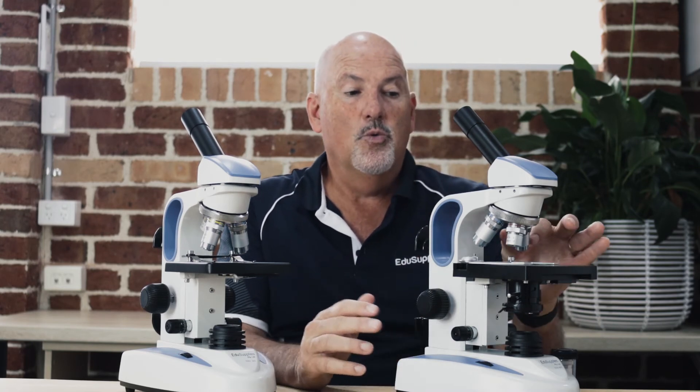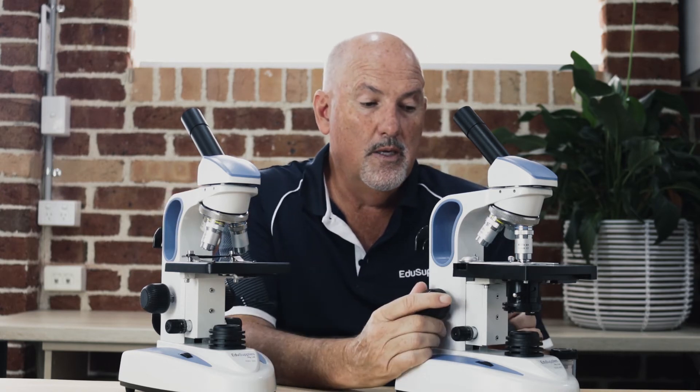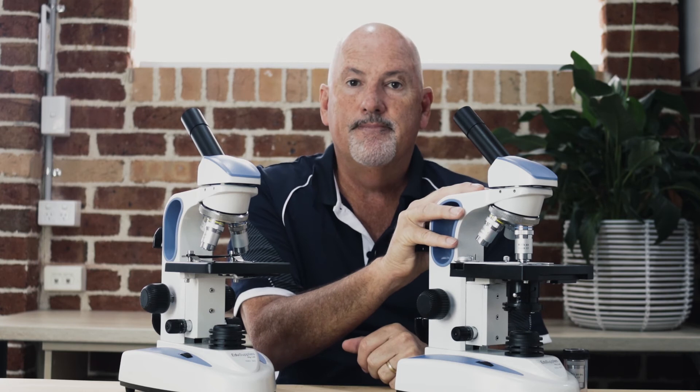If I'm recommending a microscope I would always recommend the 405 over the 305. This provides you with a much better image, especially when you're looking at blood — through this drop-down condenser it narrows the light, gives you a much better image, and you can get better depth of field because of the iris diaphragm, whereas the 305 just has a very basic disc. The other reason I'd recommend the 405 is the nice movable stage, which provides students with much easier control of the slide. The 405 is our flagship; the 305 is really a budget option if you haven't got the money for a 405.